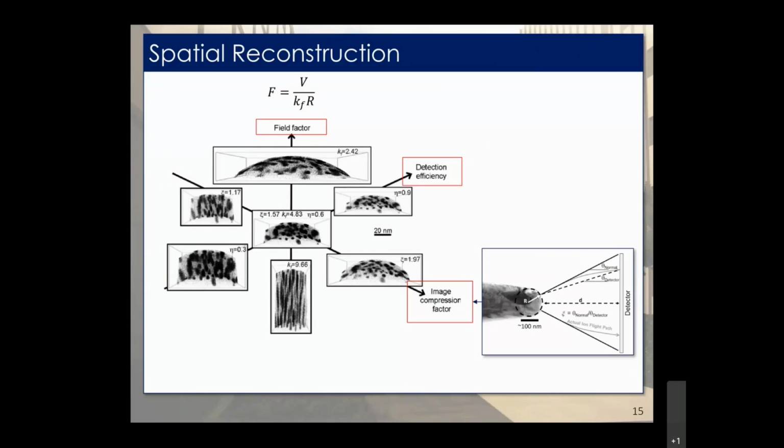But as a way of saying how much we can trust the atom probe data, one thing I want everyone to note when looking at this figure is that no matter how much this data set is stretched and squished and put through a funhouse mirror, one thing that never occurs is that the atoms are never shuffled.